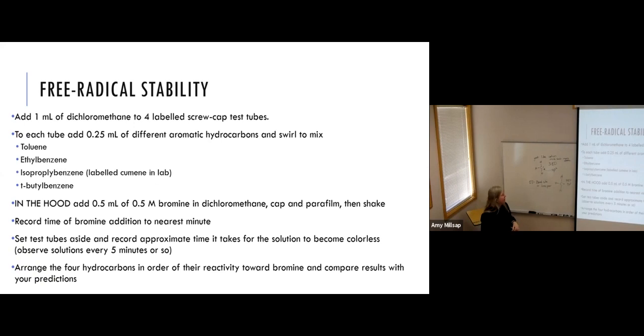We're going to be doing this in the following way. Add 1 milliliter dichloromethane, also not good for you. Also, don't spill it on yourself, don't breathe it.